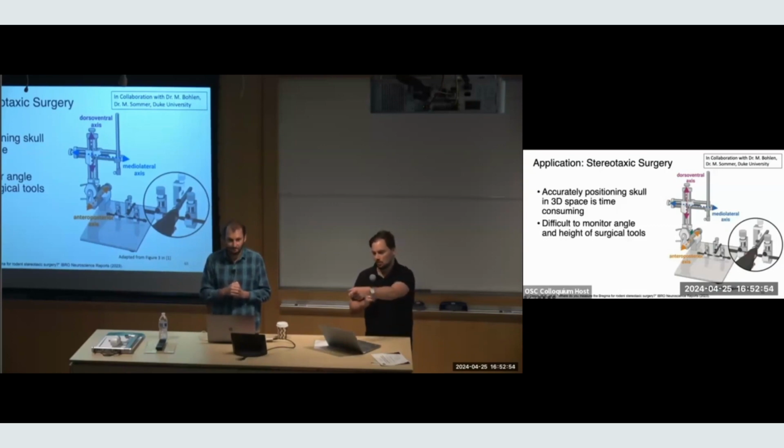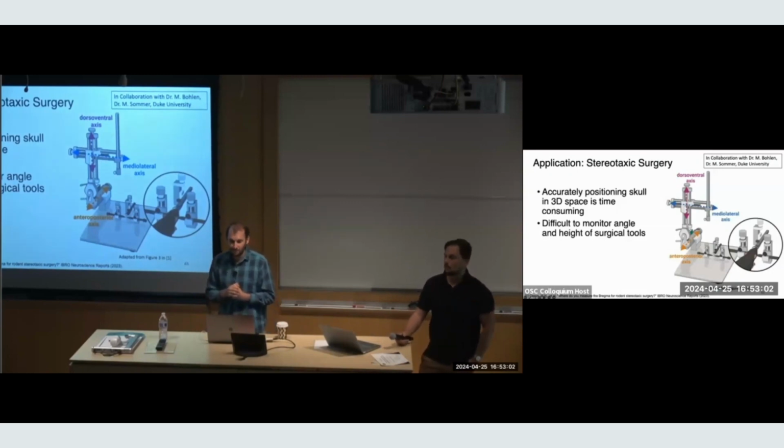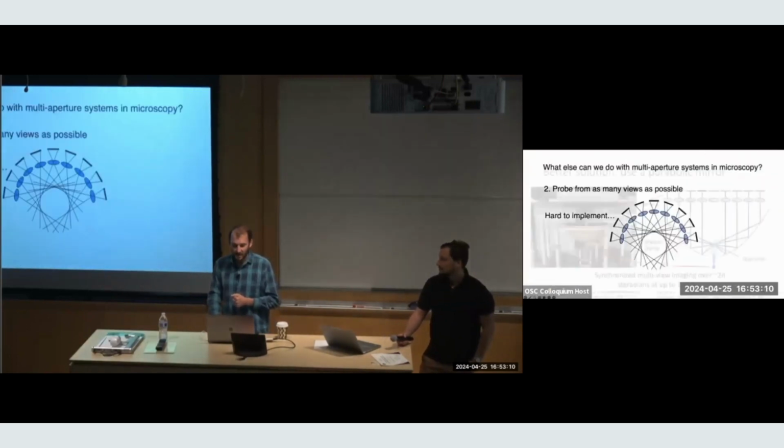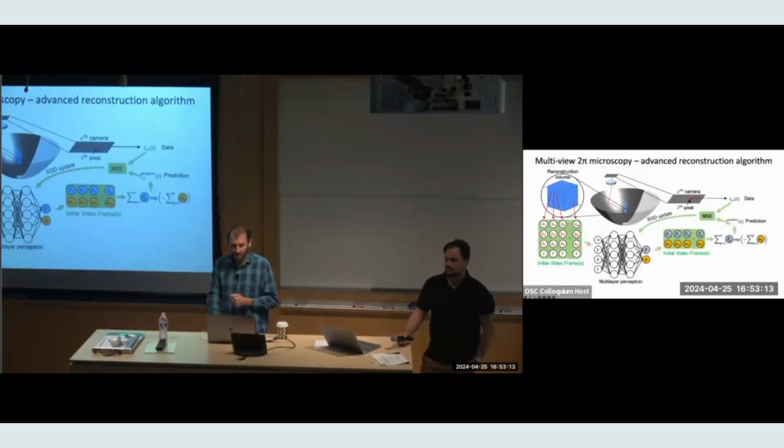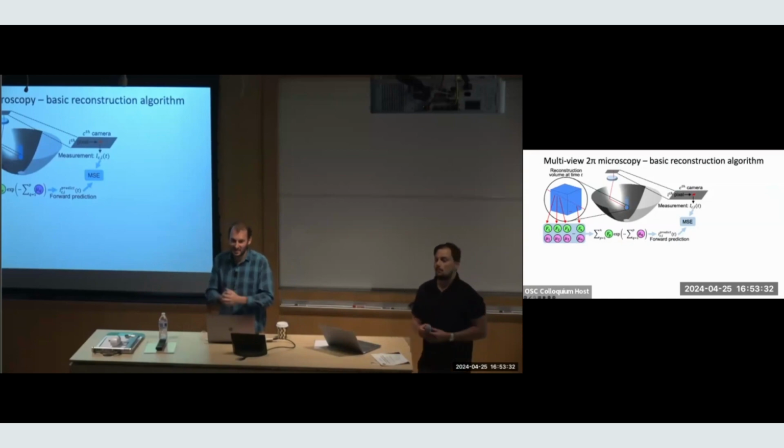I think 1 or 2 last questions. Thank you. Again, on the zebrafish, when you did the tomography, I guess it's CT, right? Did you apply filtered back projection when you did the reconstruction? Essentially, this algorithm I outlined is a spatial domain approach, right? I'll also say that we have 2 pi steradian coverage, very full coverage. There's no missing cone really for that half of the hemisphere.